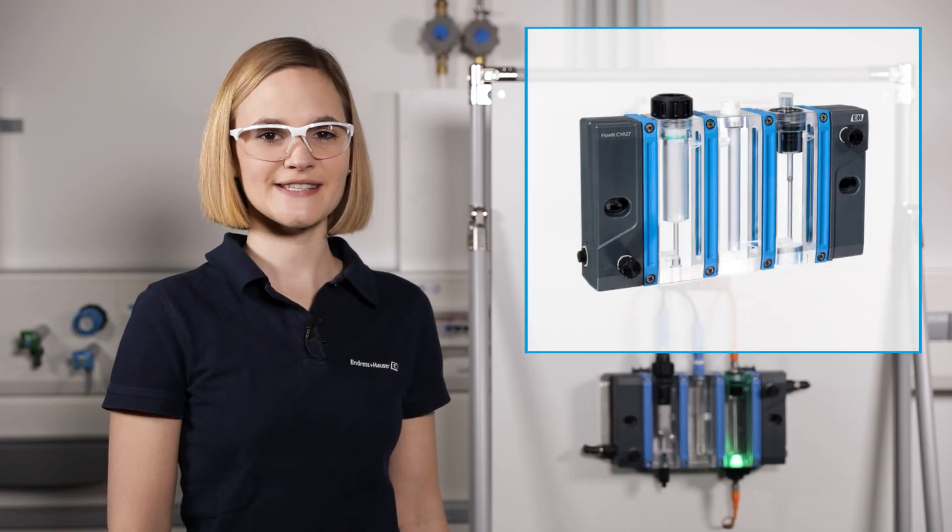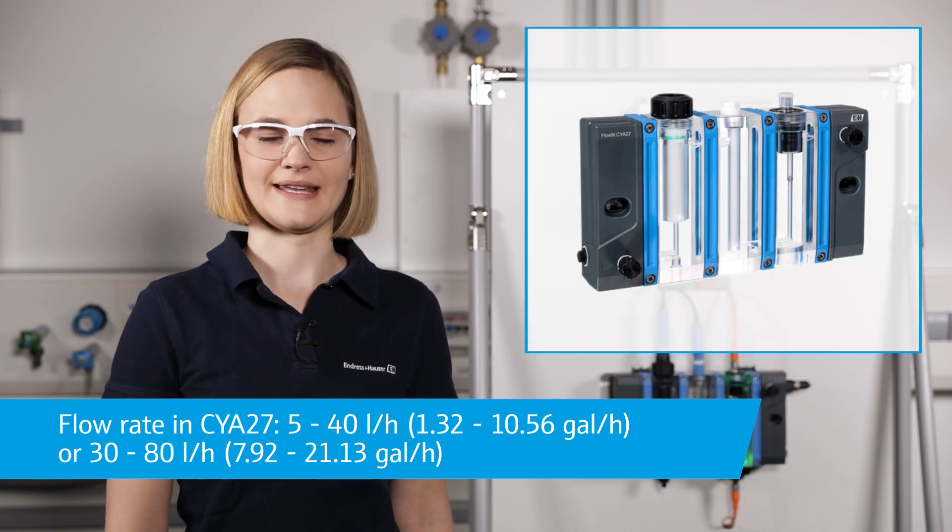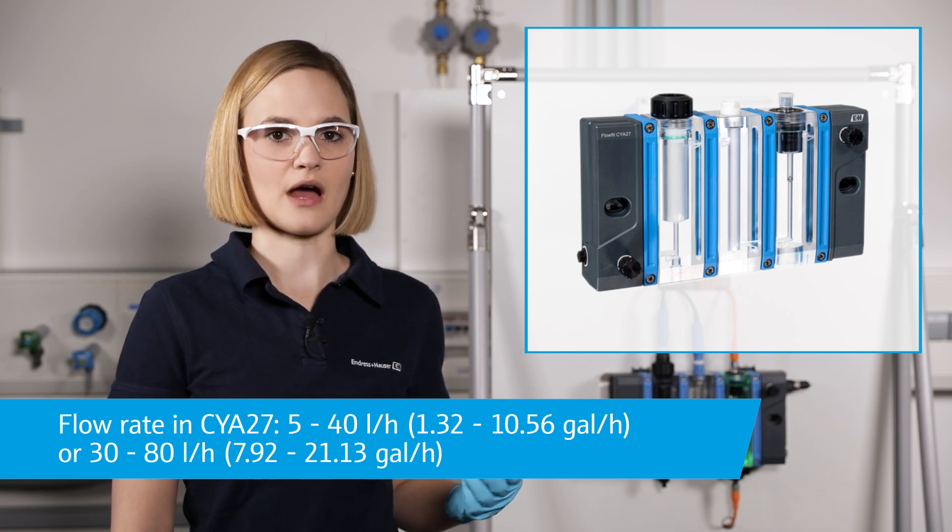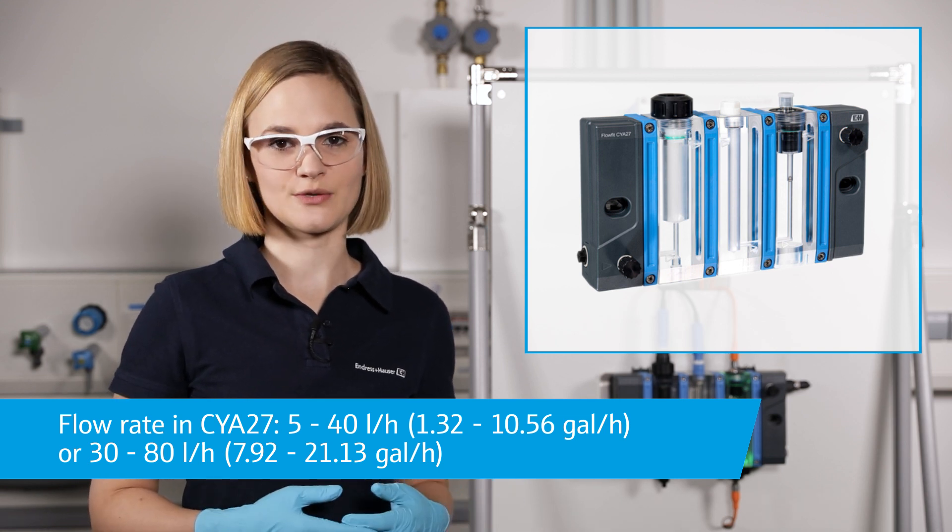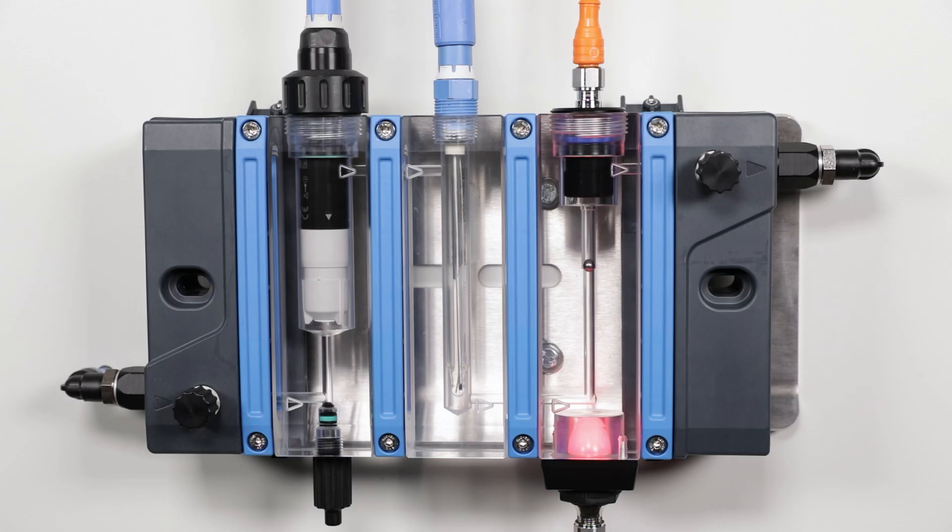Mounted in this flow assembly the flow rate must be at least 5 liters per hour or 30 liters per hour depending on the CYA27 version. Adjust the flow rate with the needle valve at the inlet module while the outlet valve is constantly open.